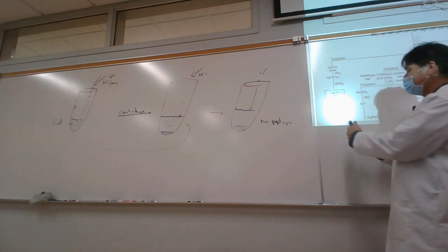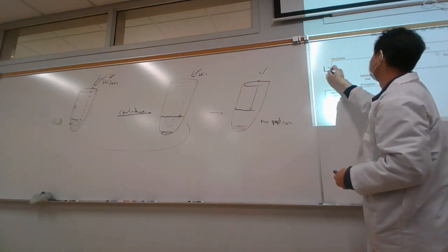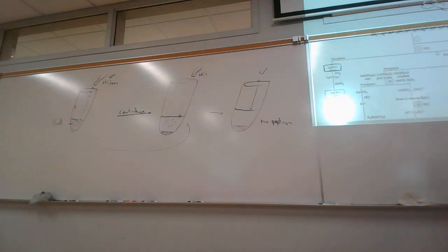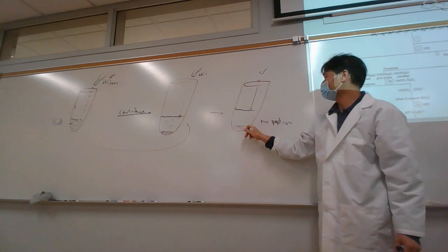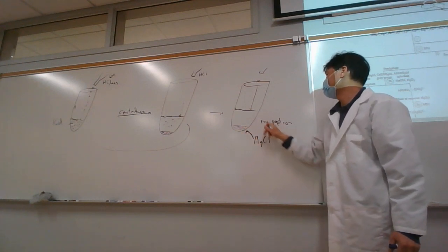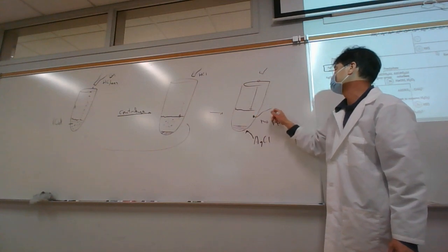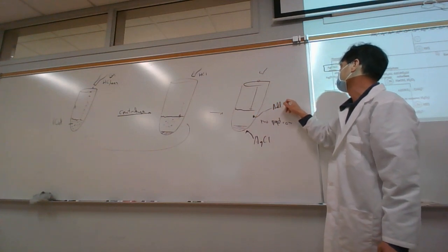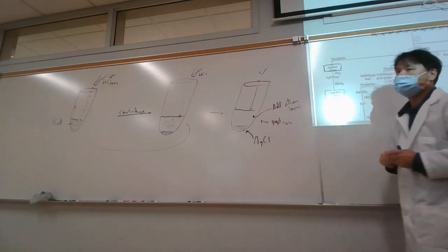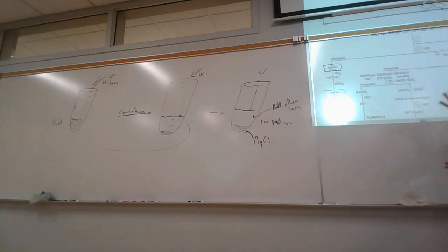Okay, so we got the precipitate here, which is the white precipitate. I wish they would have done this with the boxes. Now, what happens here is this precipitate should consist of silver chloride, and then all the other ions should be in the solution, all other ions. So what we need to do is we need to separate them.